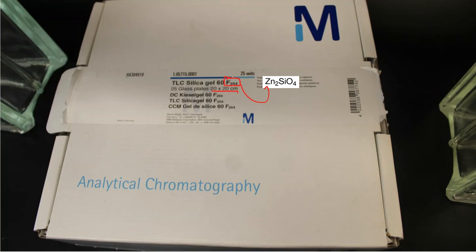All right, okay, so 25 in a case, it looks like here. These 25 typically cost me about $150 to $200, so they are not cheap at all, period. We try to use them whenever we can, and we want to make sure that when we do use them, we don't damage them. We try to prevent some of those common mistakes that most people make when it comes to plates.